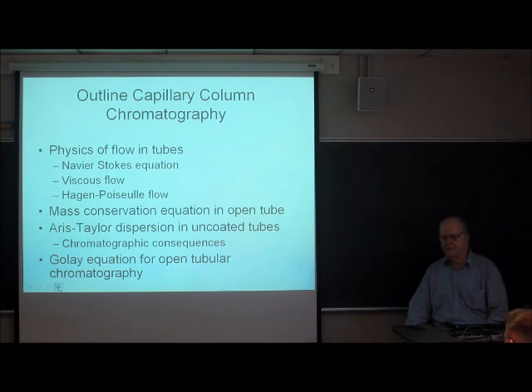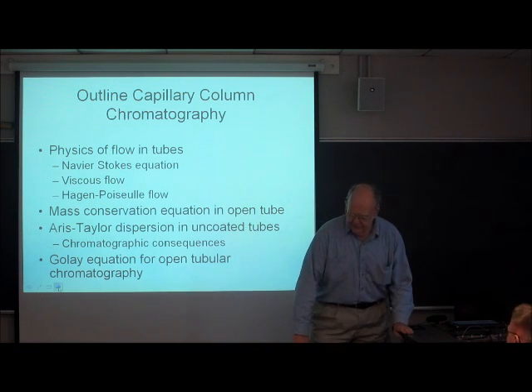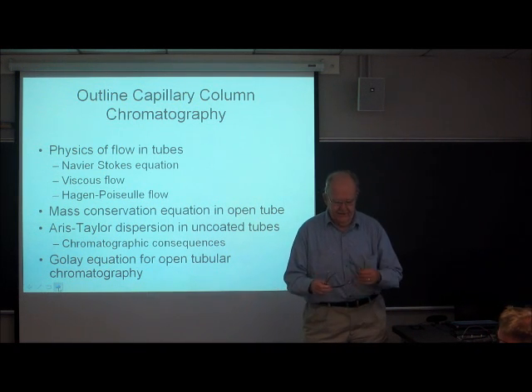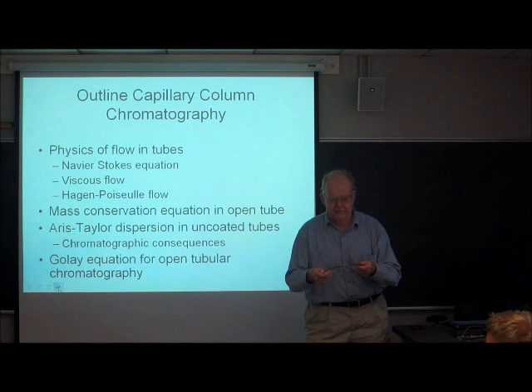Historically, capillary columns came along a fair bit after we were already doing gas chromatography and liquid chromatography with packed beds. This is a conventional packed bed column. There's a tag on it that gives a lot of information about what's in the column.